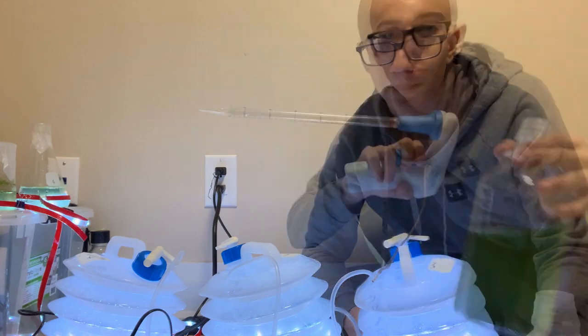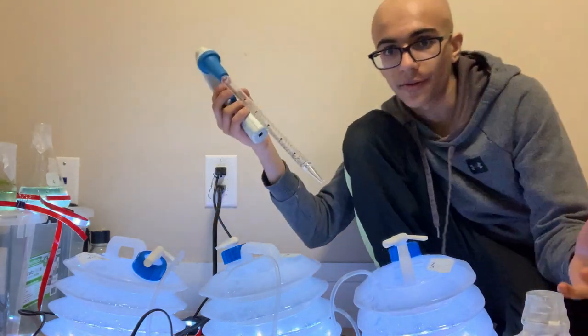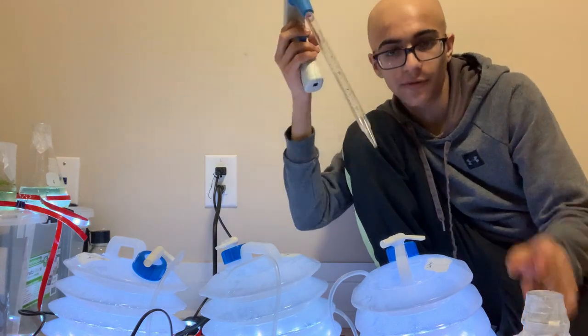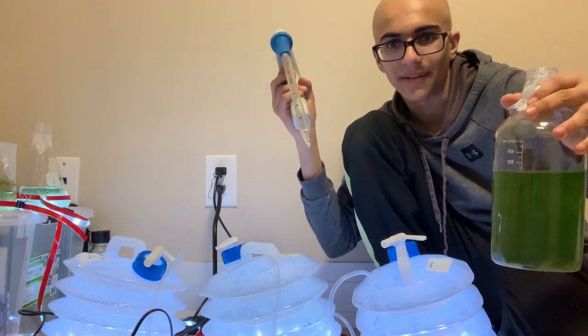So what I'm going to be doing is using a tube to get algae into the bioreactors. This is a 25 milliliter tube, and in order to get 200 milliliters, I need to put 8 of these full ones of the algae into each bioreactor. So I'm going to do that.